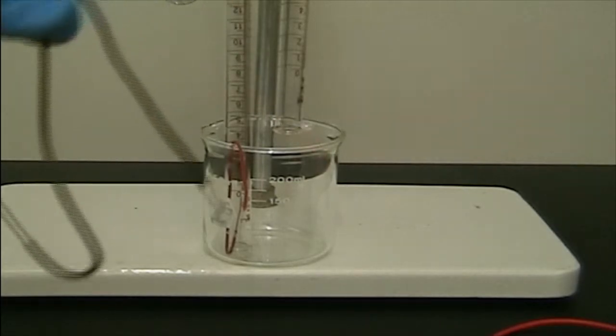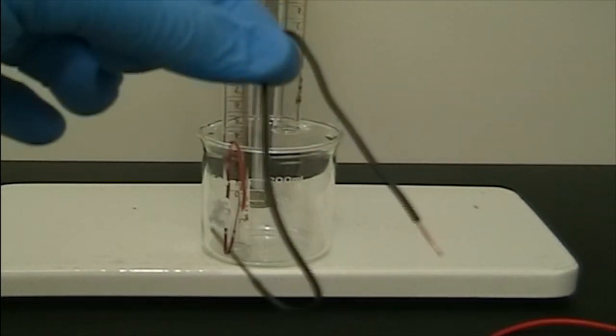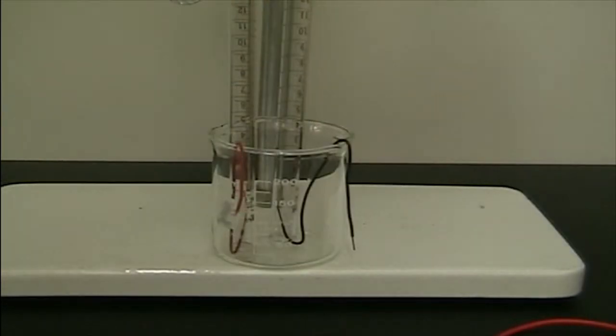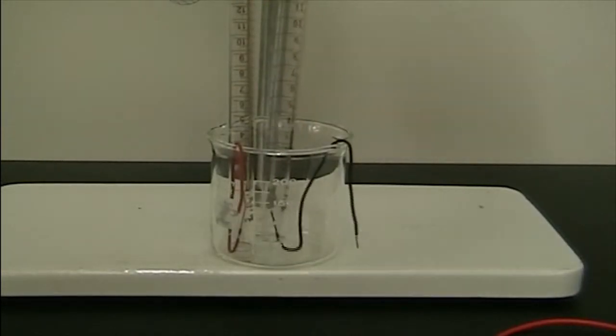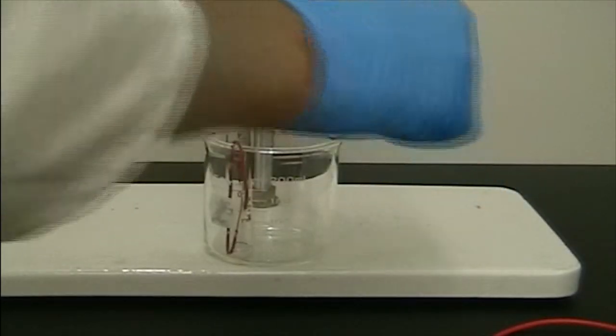At the base of each burette, a pre-bent insulated copper electrode was positioned so that one of its ends was protruding up into the burette and the other end was pointing out of and down the side of the beaker.